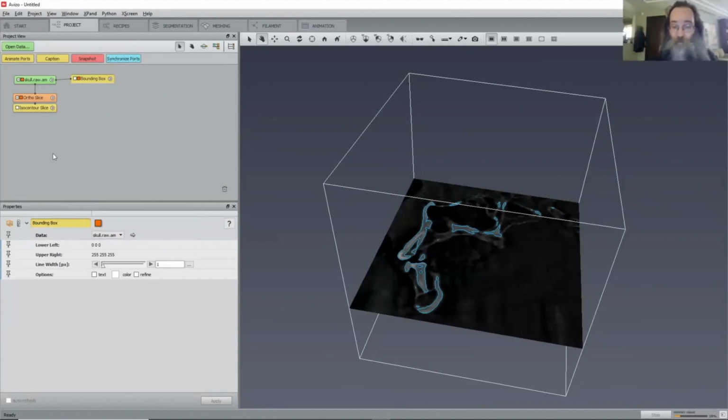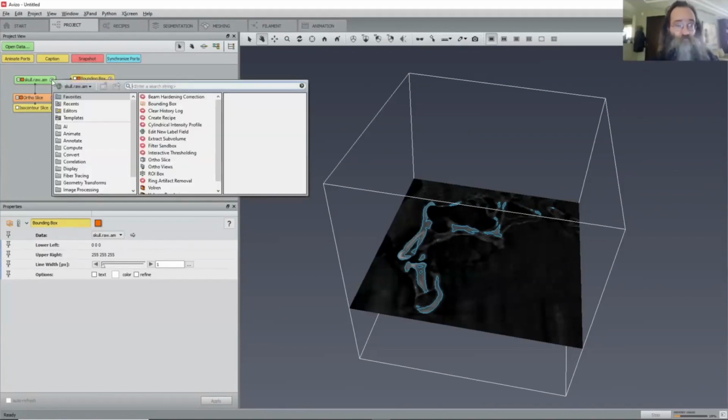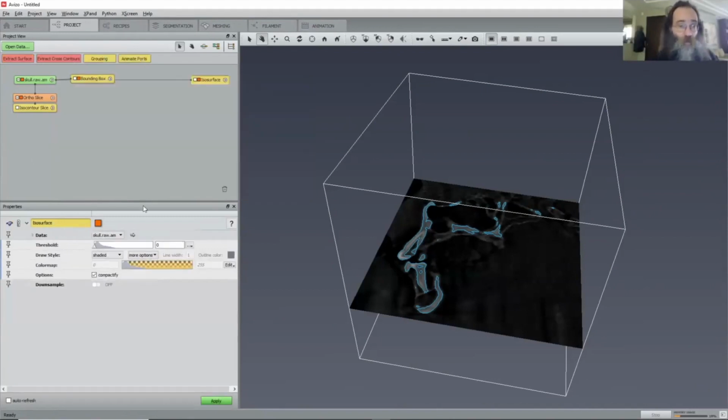But that's, of course, just a matter of taste. So we want to add an isosurface to the skull. So we click the triangle again, and we go to display, and here we have an isosurface. We create it, and there we can now select the one threshold. We take the same one as before, 56. Leave everything as it is for now, and then just hit apply.